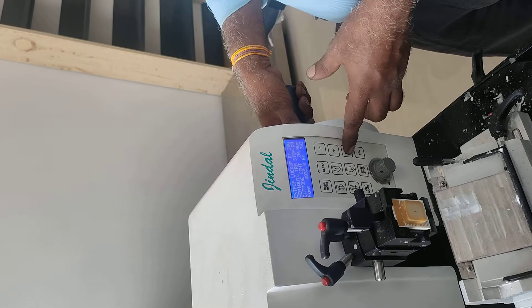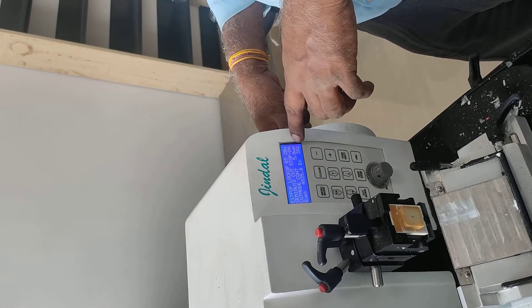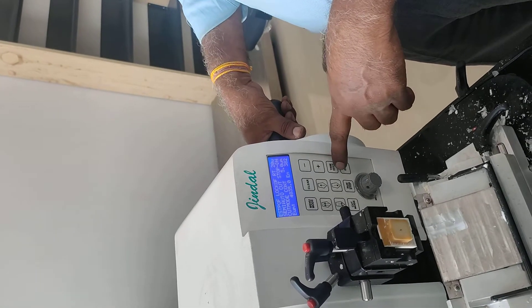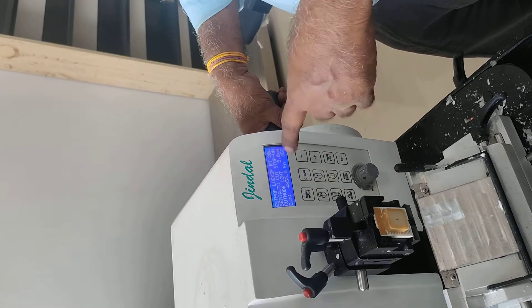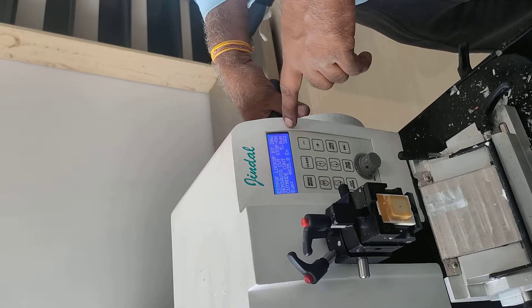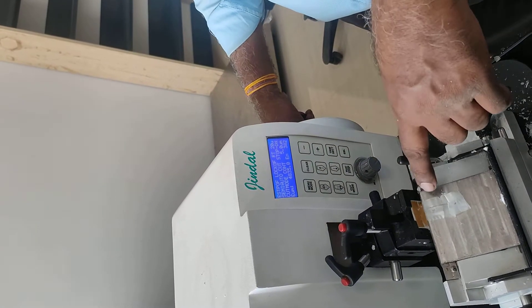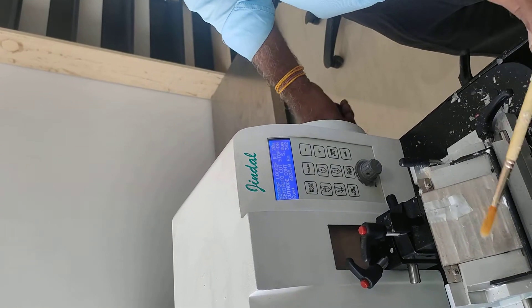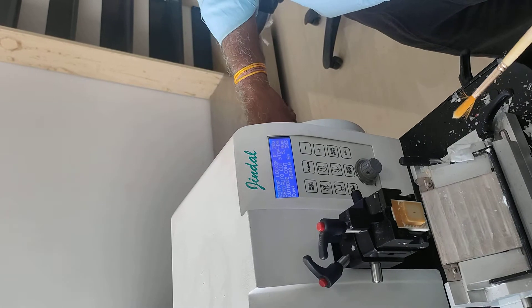So, we will select it again. We will select the cutting mode. We have to select the 5 micron. We have to touch it again. We don't have to change anything. We will just touch it and it will do it automatically on the 5 micron. Now, we will cut to size. Because it is the first read, it is 20 microns. Now, we will also read the 5 micron.